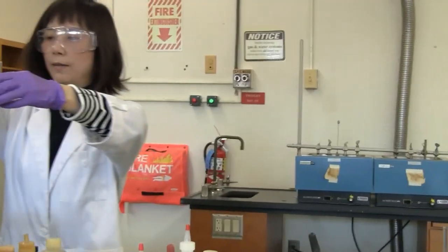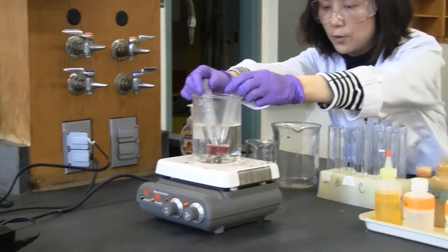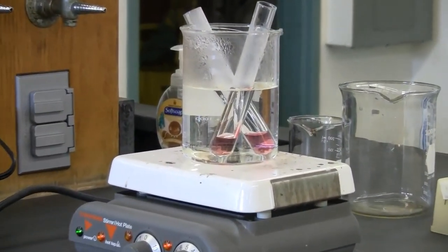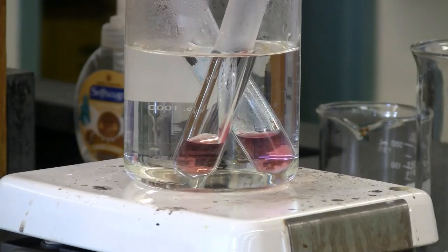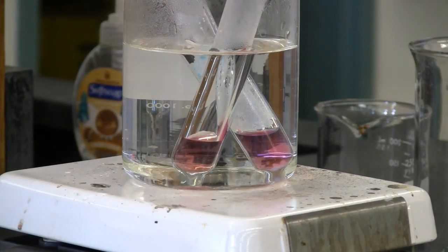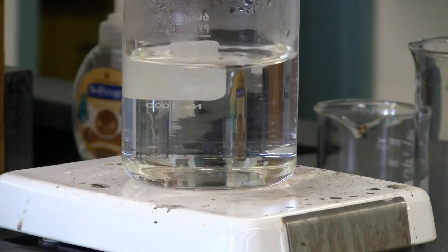So I'm going to put them in the boiling water. You're going to see the color change. So you have to wait a little bit. So the change is already happening.